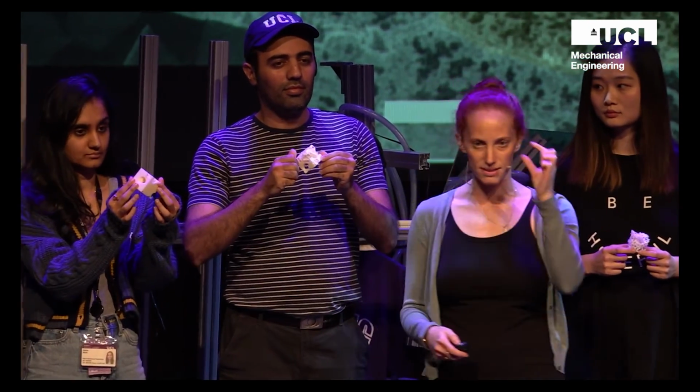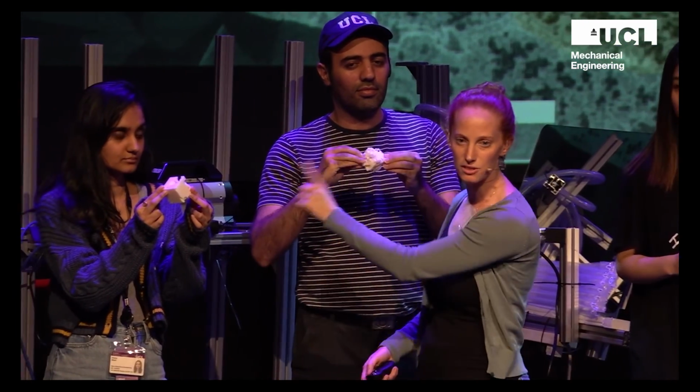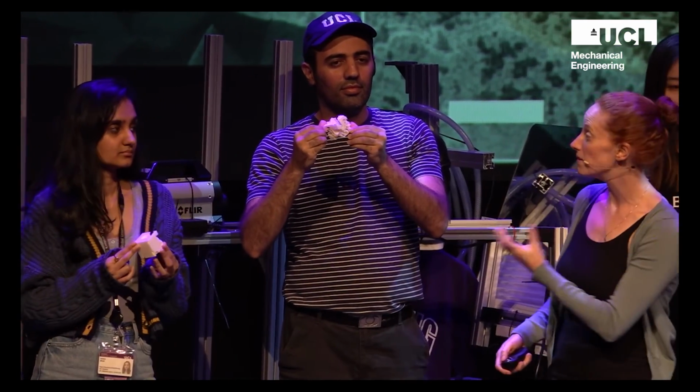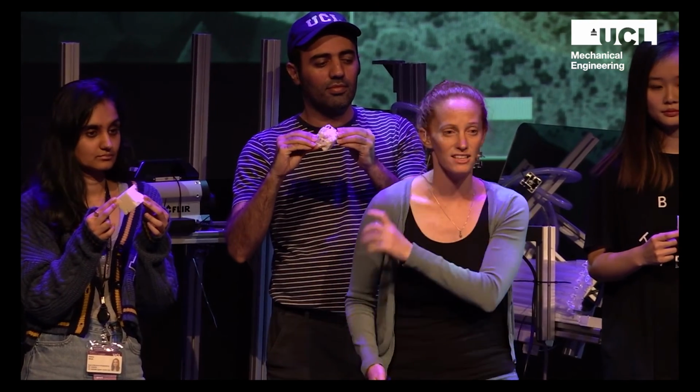Now, if we had a clinical CT scanner, and we had both of these two areas, these are about the same size as a single pixel on a CT scan would be, it would be very difficult to tell these two areas of damage apart. But in order to understand something like COVID-19, what we want to do is exactly that, understand what this structure looks like.